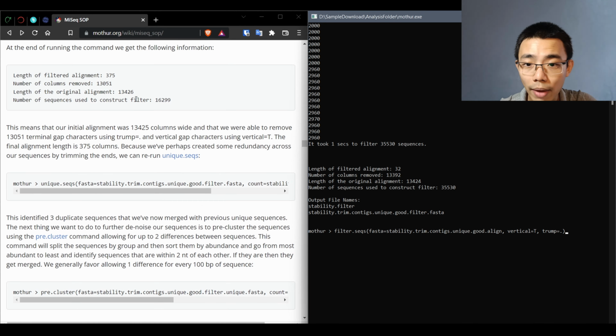Once we have finished trimming, we can run another unique sequences step, because before and after the mapping, there will definitely be some sequences that are exactly the same but are being mapped differently, and there's some sequencing error. So we are gonna reduce that down, and we're gonna have a unique and table again, and we're gonna run something called the pre-cluster.